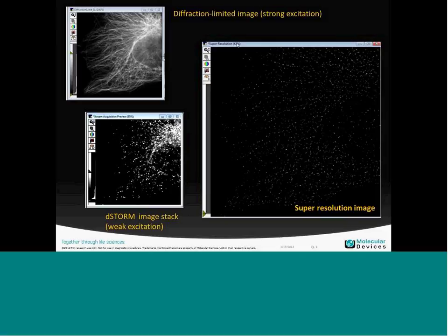In the single slide I am showing you of the Metamorph super resolution system in operation, you can see a partial movie of an experiment. In the left-hand corner is a limited image of Alexa 647 labeled tubulin. Resolution of fine detail is finite. No magnification offers any improvement. The tiniest fluorescence from adjacent fluorophores overlaps. Individual molecules are indistinguishable. The only simple idea to overcome this limitation is illustrated in the second window.